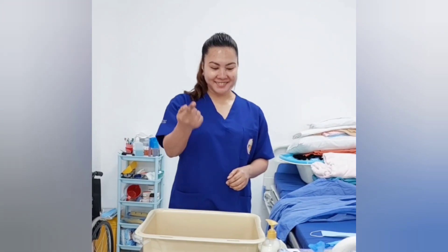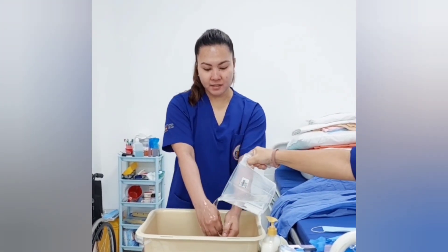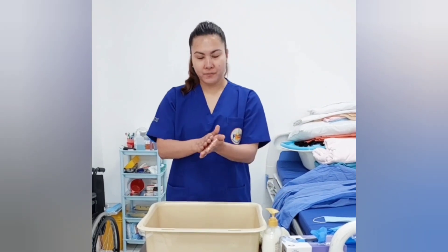I will open the faucet. Wet hands with water downward to eliminate dirt. Apply enough soap to cover all hands.